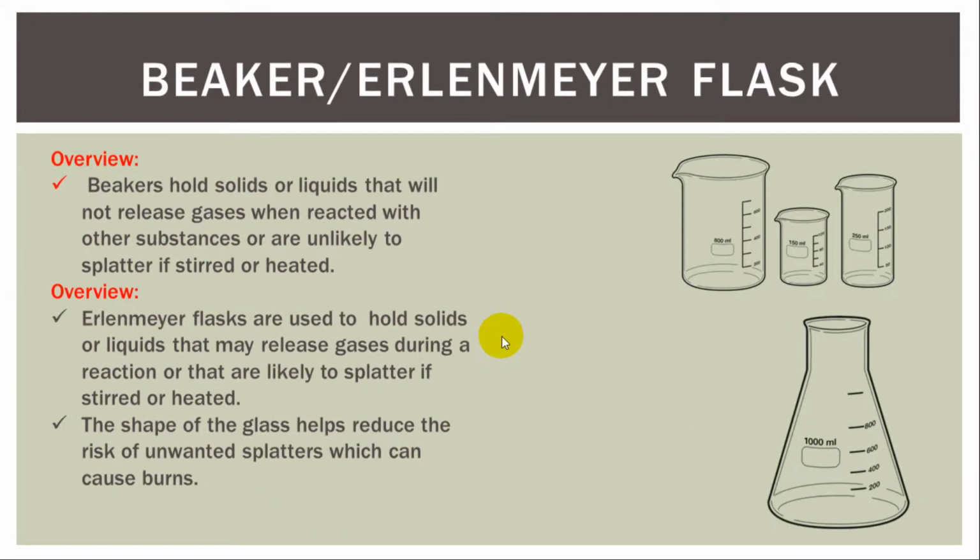First, let's start with the beaker and Erlenmeyer flask. This is a beaker right here. Let me read you what it does. Beakers hold solids or liquids that will not release gas when reacted with other substances, or are unlikely to splatter if heated or stirred. So let me give you a representation here.